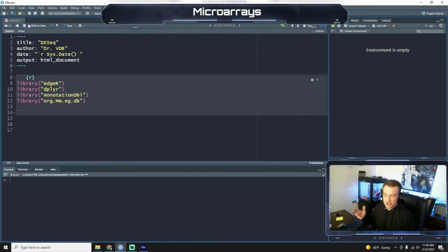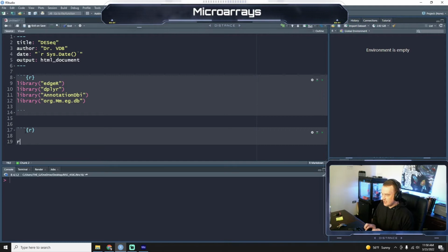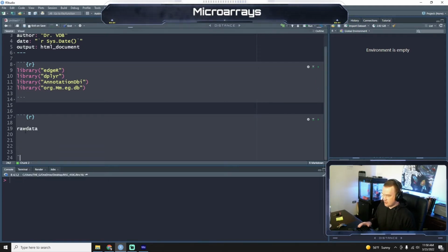This data you should have transferred over when you transferred all your files in the previous video. So let's start by making an R code chunk, and we're going to load our raw data. Let's close off our chunk.